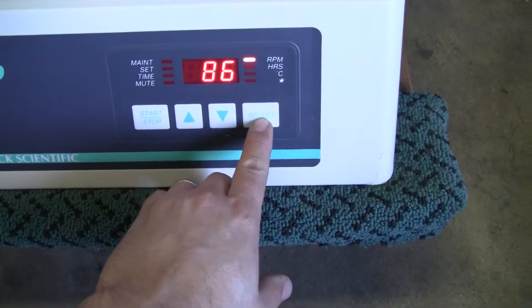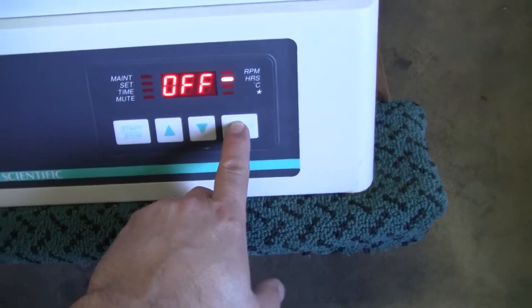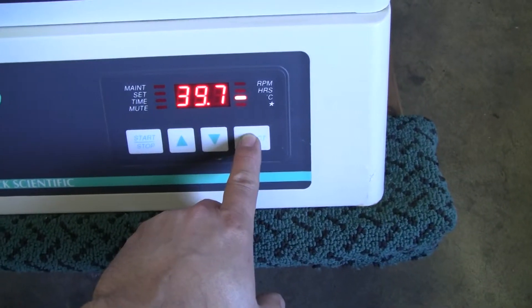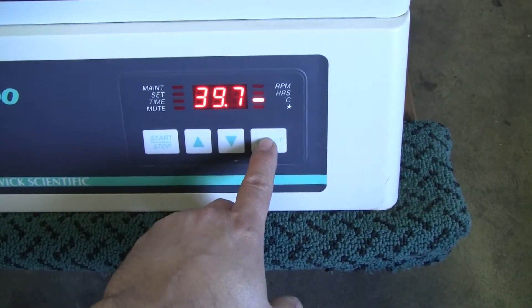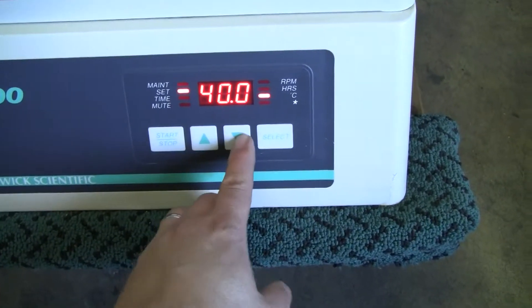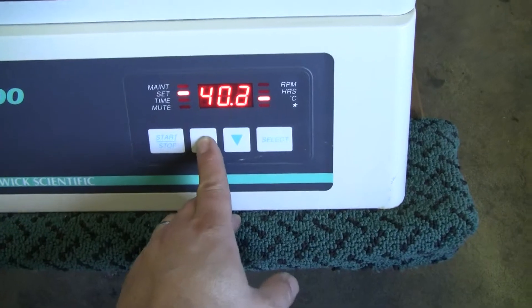I'm scrolling down. You can see the RPMs. I have it set on continuous mode. I have the temperature set at 40 degrees Celsius, so it's holding around there. I can jack it up, and we can see it heat.